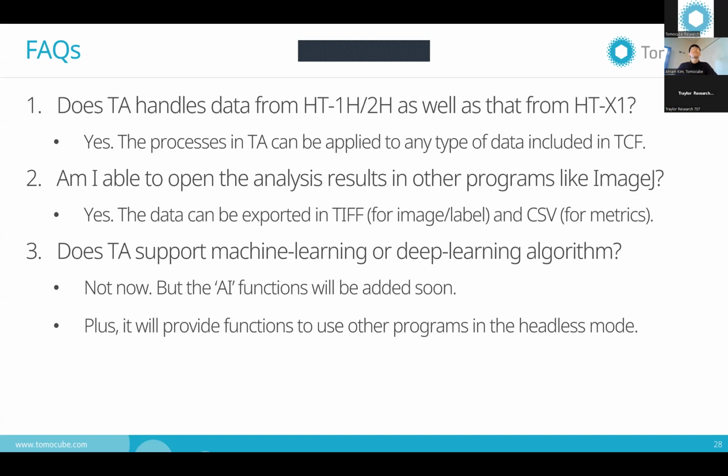Yeah, that's a very fundamental question, because in our case we take Z slices, and because the resolution in X, Y, and Z is different, the LD shape is not that spherical. In any slice it looks circular, but when combined, it's not a sphere, it's more like a rugby ball. It depends on the sample and the size of the LD, but you should be careful about interpreting the results. But at any rate, in any slice, it is circular anyway.